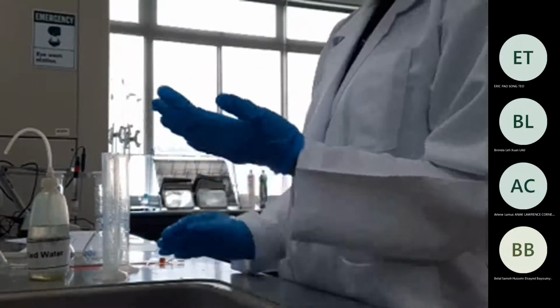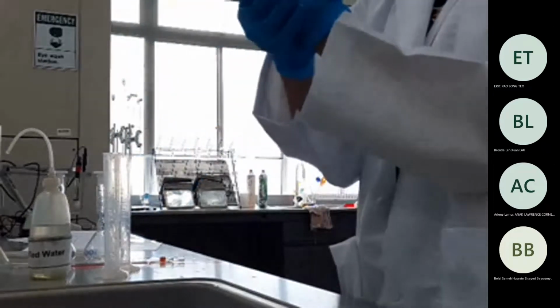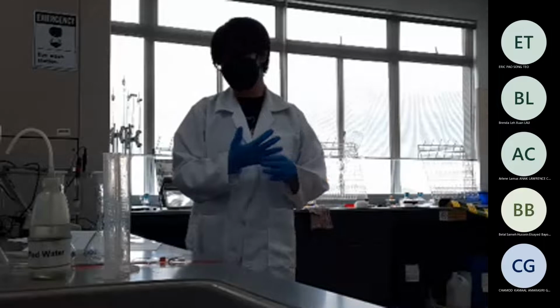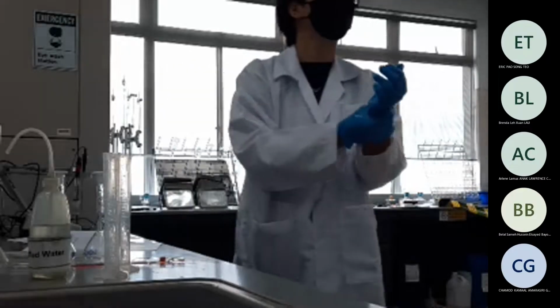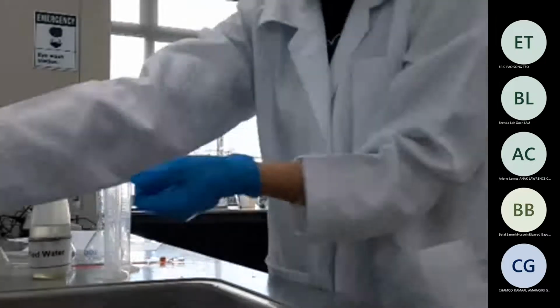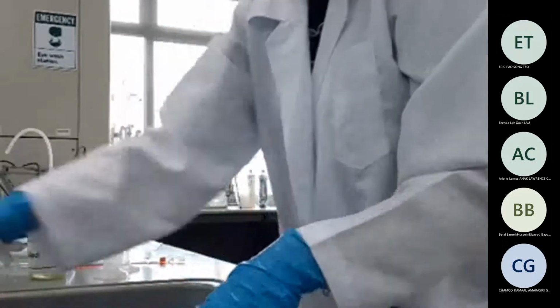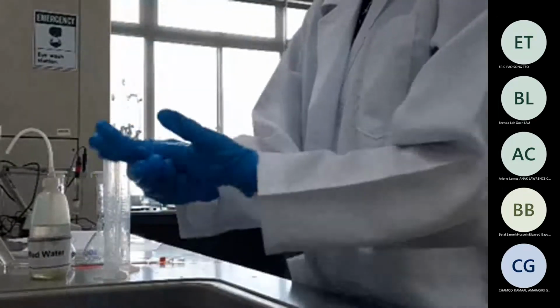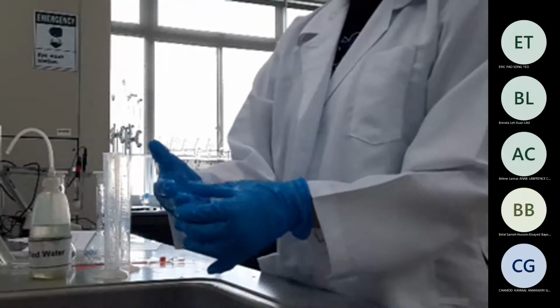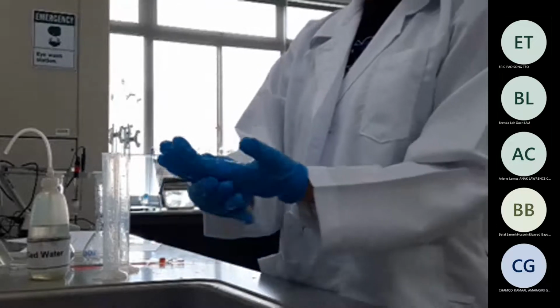For the reagents and chemicals, please follow this whiteboard. Fume hood 3 is your ethanoic acid or acetic acid and hydrochloric acid. Fume hood 5 is sodium hydroxide and sodium acetate. Fume hood 6 is ethanoic acid, 0.1 molar, 0.1 hydrochloric acid, and the waste bottle. So do not dispose anything in the sink. Please dispose all of the waste, part A and part B, into the waste bottle in fume hood 6. Do not throw anything down the sink.